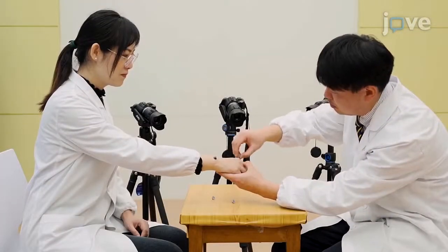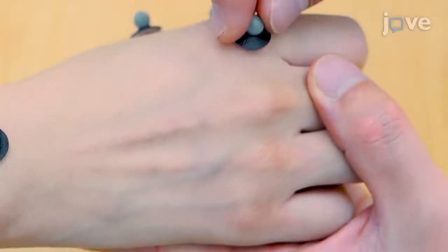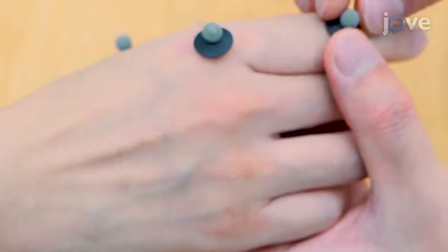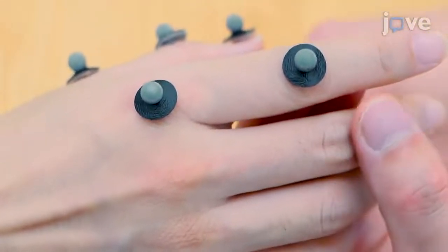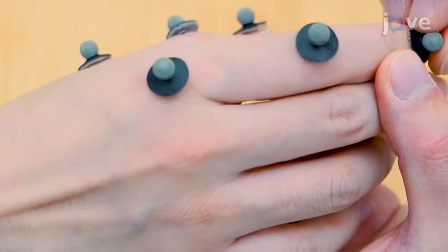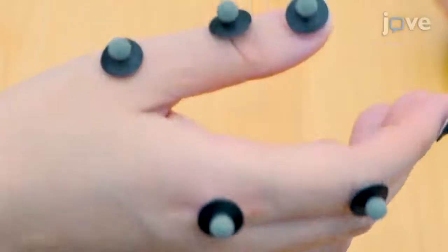Next, attach one ball at the metacarpophalangeal joint, defined as tracking point: forefinger base joint. Attach one ball at the proximal interphalangeal joint, defined as tracking point: forefinger middle joint. And one ball on the center of the forefinger nail, defined as tracking point: forefinger tip.